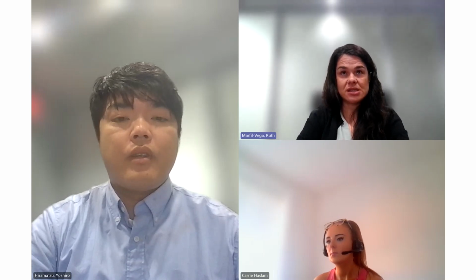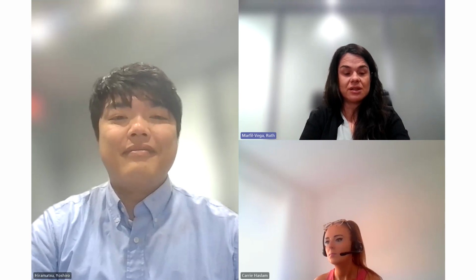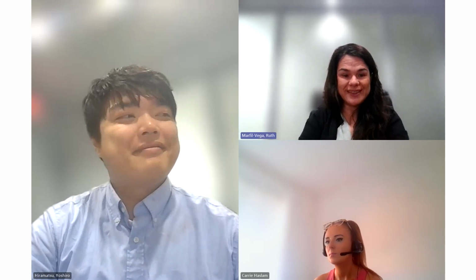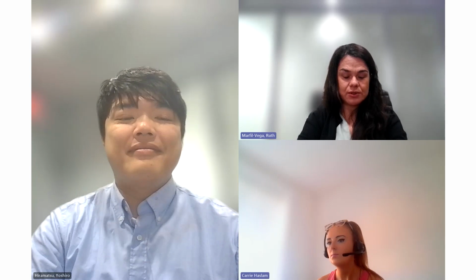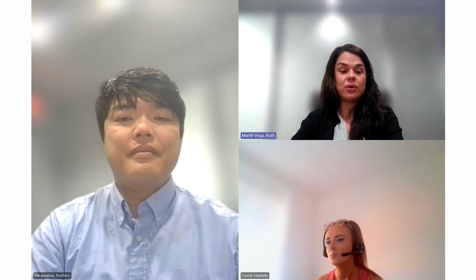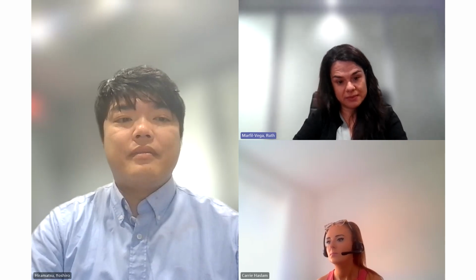And the reason why this is fast is because in Shimadzu's files, we can find tuning information, the status of the instrument, and the method. So let me correct my answer for a second. We need two files. One from when the instrument or the application was performing as it should, and one file from after you notice that there are some problems. So with those two files, the before and after, we have everything that is needed to kickstart the process.